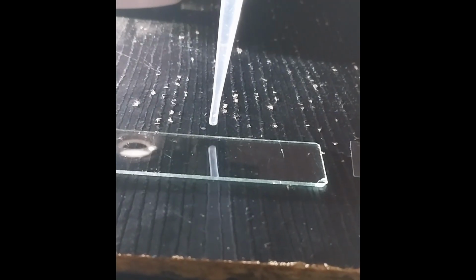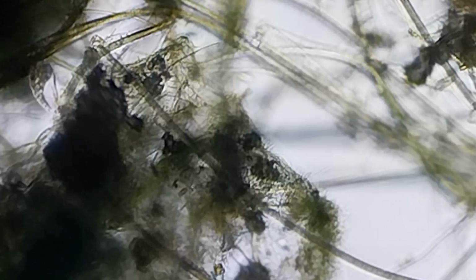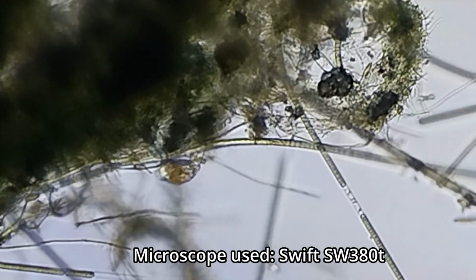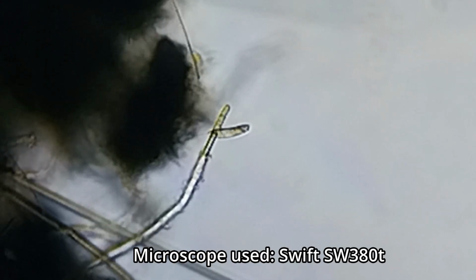Let's take one slide from the last sample. This one consists primarily of microalgae. I collected it from the sides of the freshwater body. I placed a few drops of it on a slide using a pipette. Then, I covered it with a cover slip. Under the microscope, we can see that the primary inhabitants of this sample are rotifers and cyanobacteria. I also saw this euglenoid, probably Paranema.